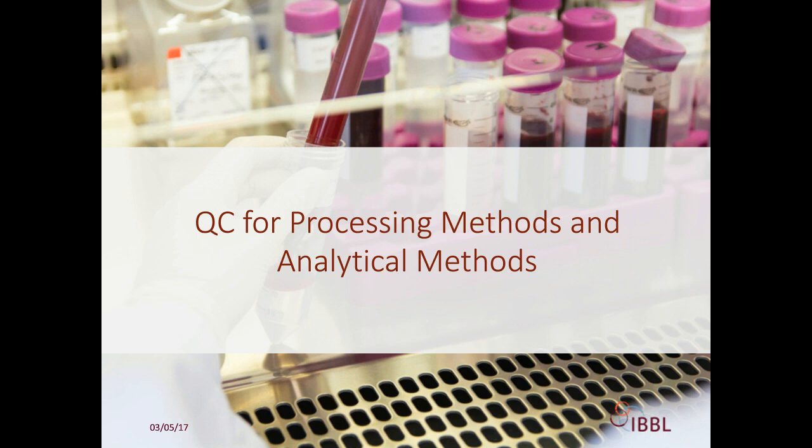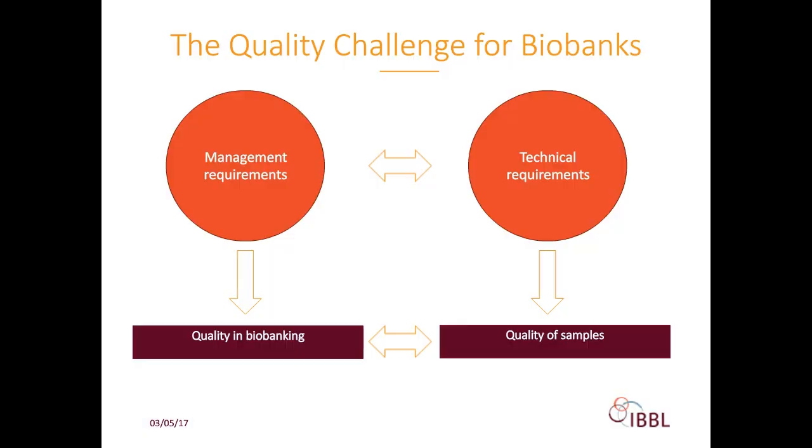Now, first of all, as you know, biobanks are research infrastructures collecting, processing, qualifying, storing, and managing samples to be used in research. As such, biobanks face specific quality challenges. They must fulfill not only quality management requirements in order to ensure quality in the biobanking processes, but also technical requirements in order to ensure quality of the samples they provide.